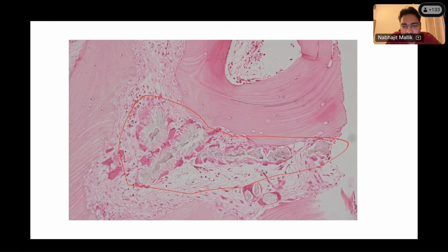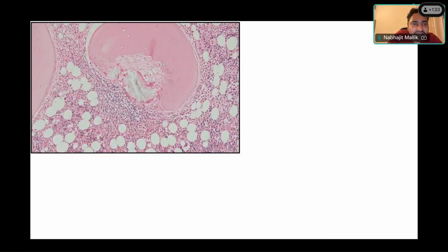Jasleen, can you see what these are? Crystals? Are they crystals? Absolutely beautiful, right? They're crystals. And what kind of crystals? You can see here again. There's also one, and they're beautifully arranged almost in a flower-like pattern, right?